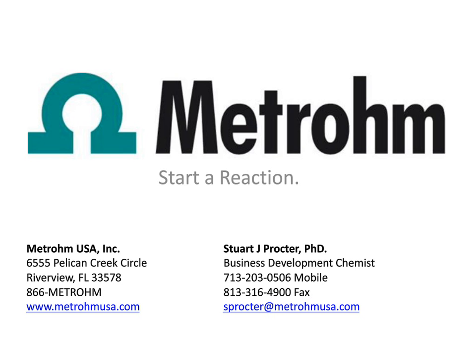Thank you, Joni. This is Joni, and I totally agree with Jen. If I could just expand on that a little bit, it doesn't even have to be a difficult matrix like avocado. It can be something as simple as urine or plasma that many people will just dilute and shoot, and actually that will be fine at first.